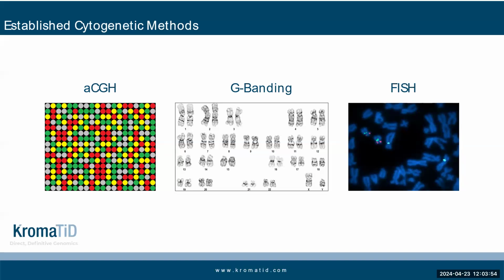G-banding relies on staining differences between chromosomal regions, which are relatively AT-rich or GC-rich, looking at one cell at a time. The signature banding patterns allow identification of chromosome segments down to approximately 10 megabases, enabling characterization of complex genomic changes.